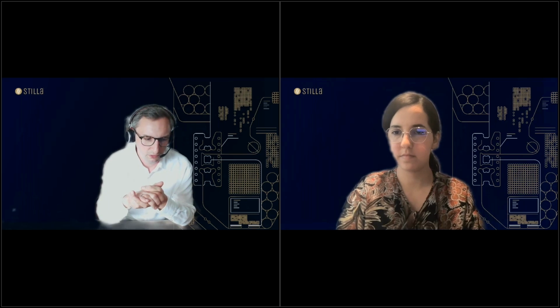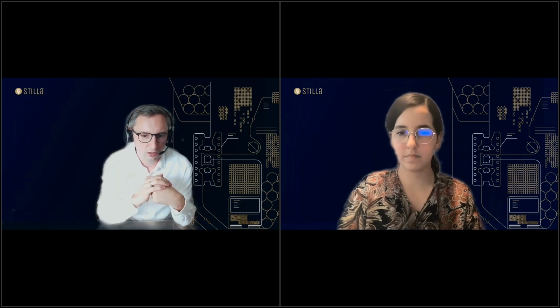So if you have an MGB that works great, use it. I'm happy with it. And there's also nothing, I would say from the legal side, which hampers you from using it. LNAs, from my perspective, are just a bit easier to use once you know them. So briefly, if you want to use an LNA, put it at the position of the SNP.